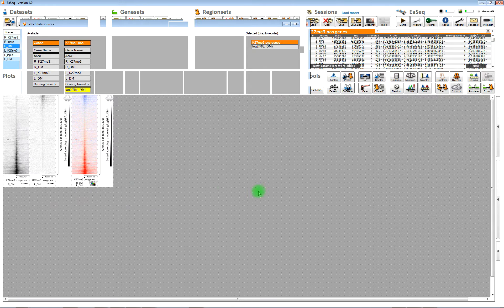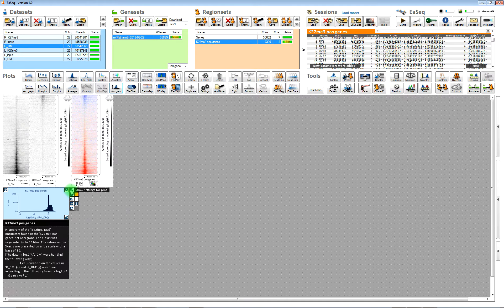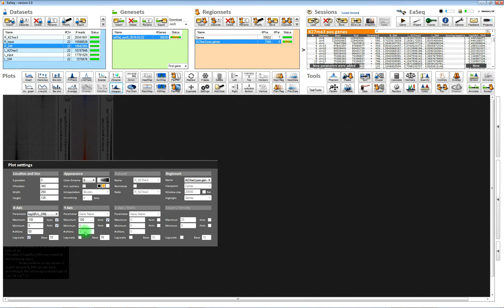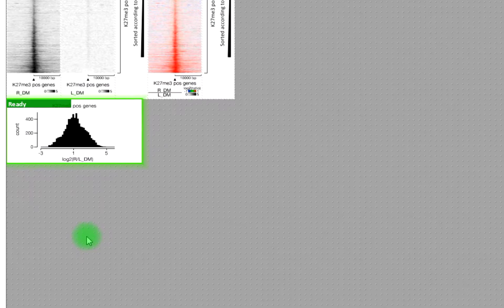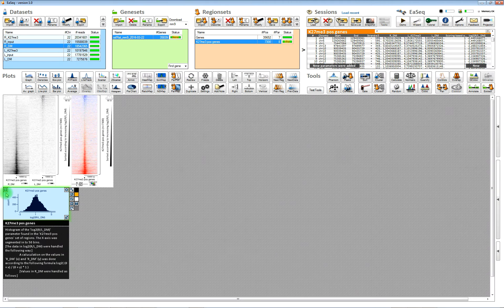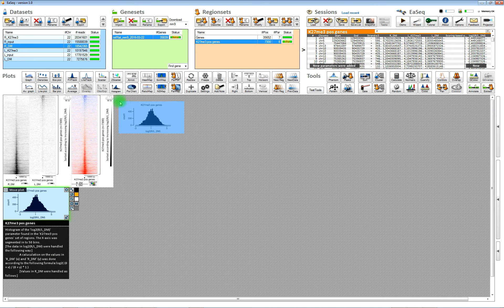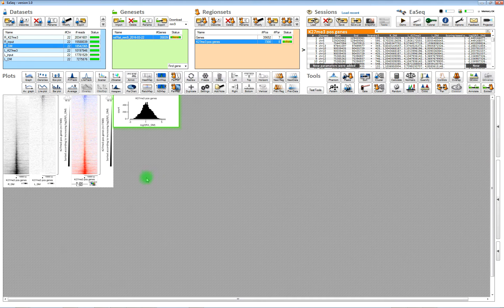We can also make a histogram here. We will need to deactivate the log scale on the x-axis, then we get a more clear histogram here.